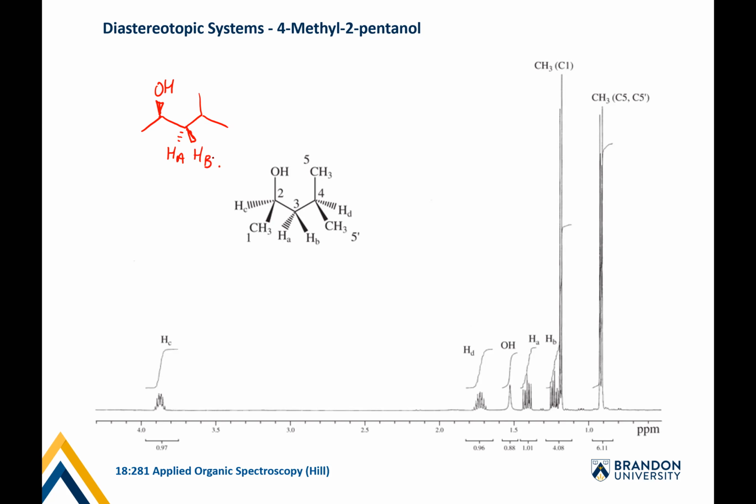The 3 protons on this carbon here are going to be equivalent.